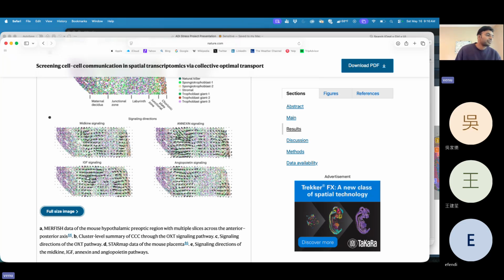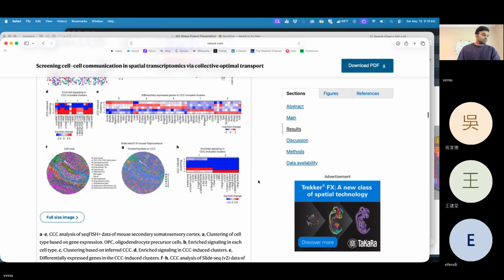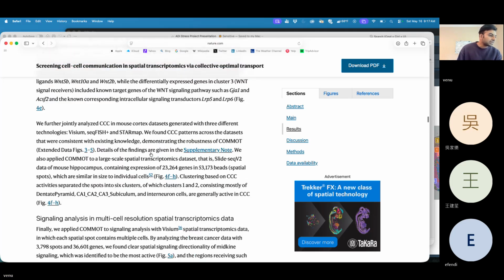This is how it usually looks. This spot is moving towards the other, like this side. That means here there are two kinds of cells. One is epithelial and another one is something else. Based on their marker expression, they are saying that this is signaling. They look into all the neighbors and confirm IGF signaling here. And in a similar way, spatial. Okay, they have cell type information here. They have the majority of cells as primary cells, and within the primary cells they have secondary cell spots. That will reveal the interaction between these two spots. Okay, these two spots.